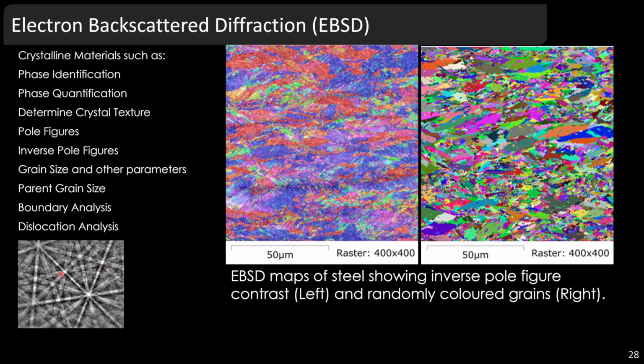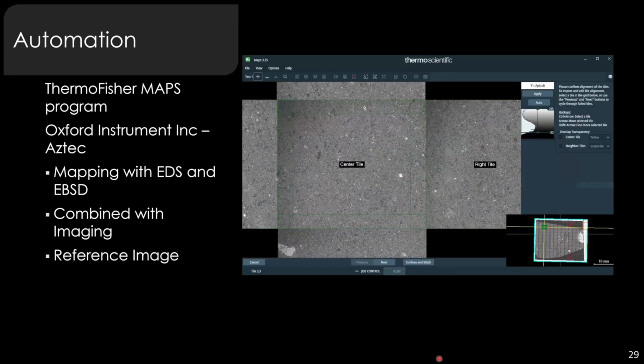There are programs out there that take the patterns and do further refinement of them to identify things better. Some of that software is starting to be included in the EBSD software for an additional price by the companies. So that can be very useful. The microscope gets used a lot for EBSD, so it tends to be the main expertise I usually have.